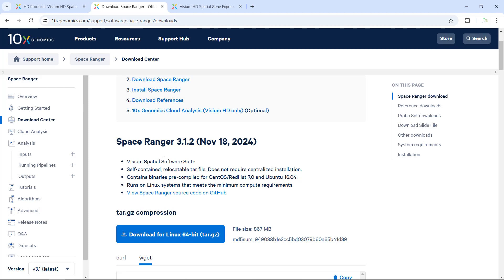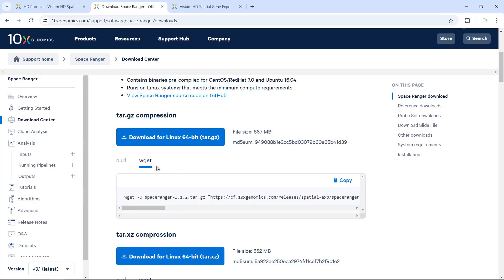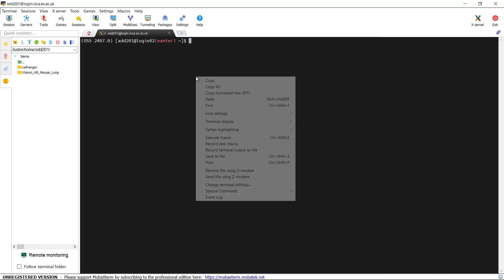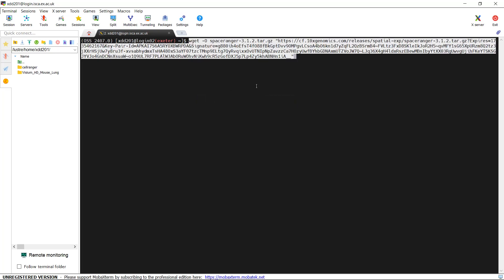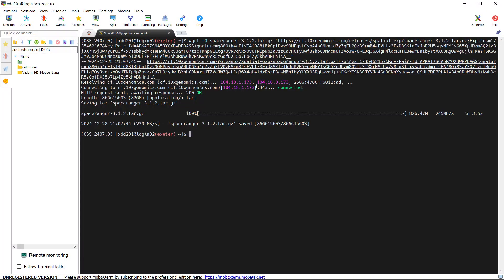You can see here is the 10x Genomics website. We can use the wget function to download the Space Ranger 3.1.2 software. We can copy the link, then go to the high-performance computer. You can see I logged into my high-performance computer account. We can paste the link here, then download the software. You can see it is very quick — it only takes 3.5 seconds to download the software. So now we can unpack the Space Ranger software.